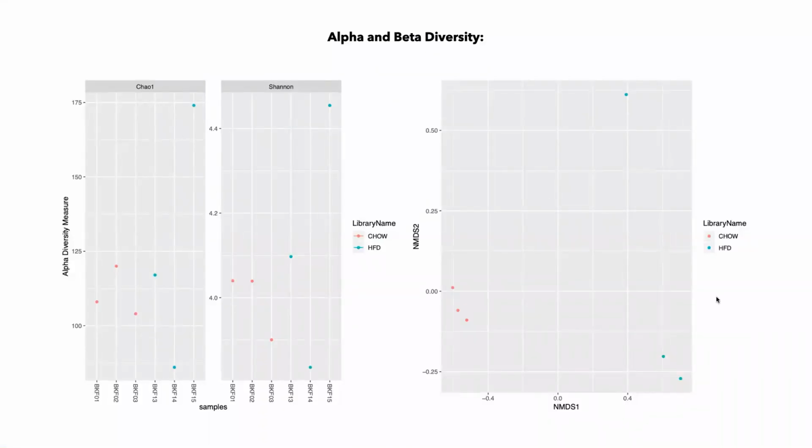Okay, this is beta diversity, which looks to identify something kind of like a principal component analysis, but called NMDS. So this is multidimensional scaling. MDS is multidimensional scaling. It shows us a separation between these two types, right? So it actually shows us a very clear difference in diversity. This is within a sample. This is a measurement of diversity within a sample.